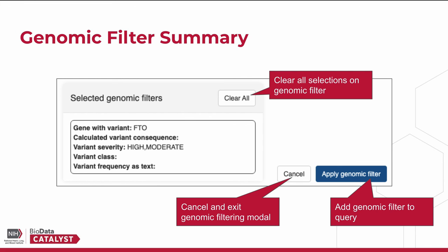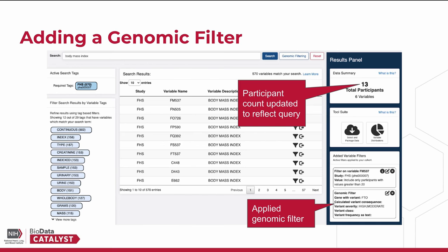Let's add the filter to our query. Once the Apply Genomic Filter button is clicked, the results panel on the right side of the screen will be changed. The participant count in the data summary box will be updated to reflect the new query criteria. In this case, there are 13 participants that have a body mass index greater than 20 and a high or moderate severity variant in the FTO gene. Additionally, we can see the genomic filter listed in the Added Variable Filters box.